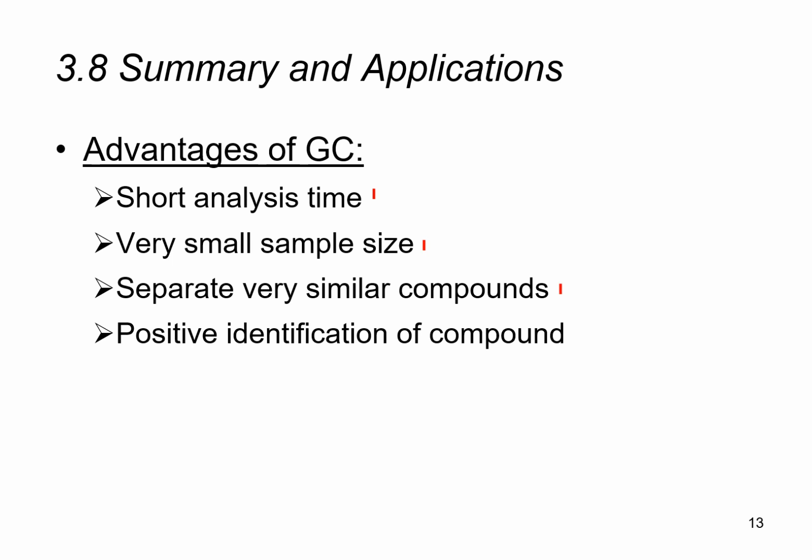The gas chromatography instrument is also able to separate very similar compounds that belong to the same family. For example, if you have methanol, ethanol, and propanol, they're very similar compounds that belong to the alcohol family. But GC is able to distinctly separate these compounds based on the column used, and can give us very identifiable retention times for each of these 3 compounds.